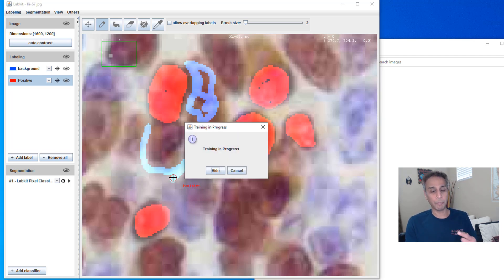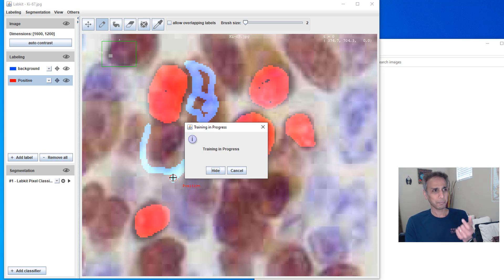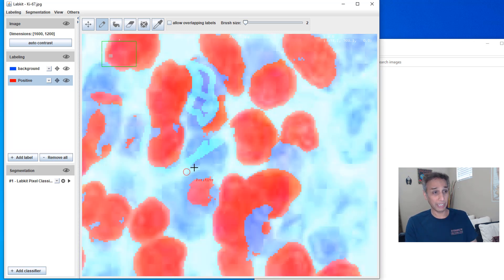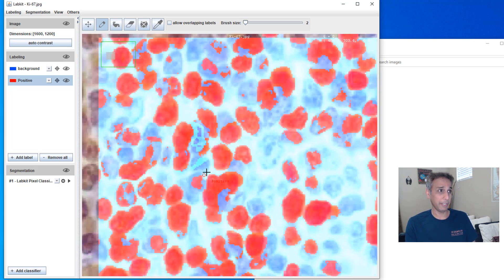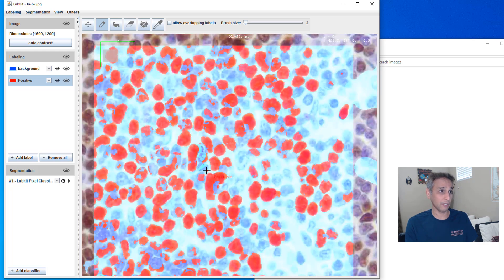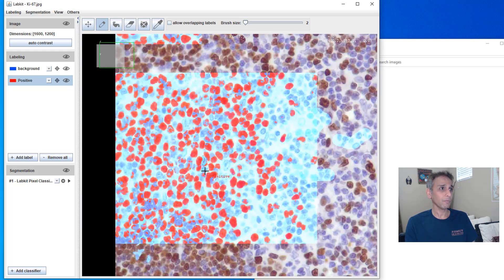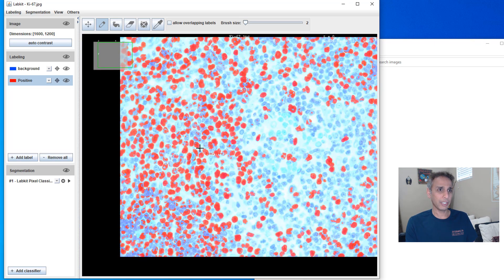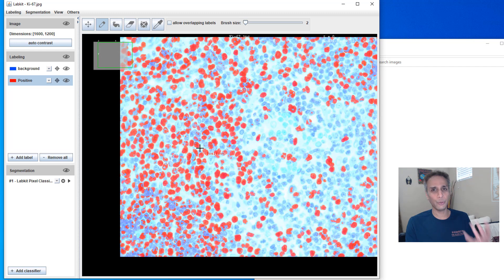Okay, I'm happy. Let's go ahead and hit the train process. The first time the training is a bit slow probably. The subsequent times, it should be a bit better, faster. Okay, so there you go. This is how it looks like and you do this in an iterative way. I think you got the idea.